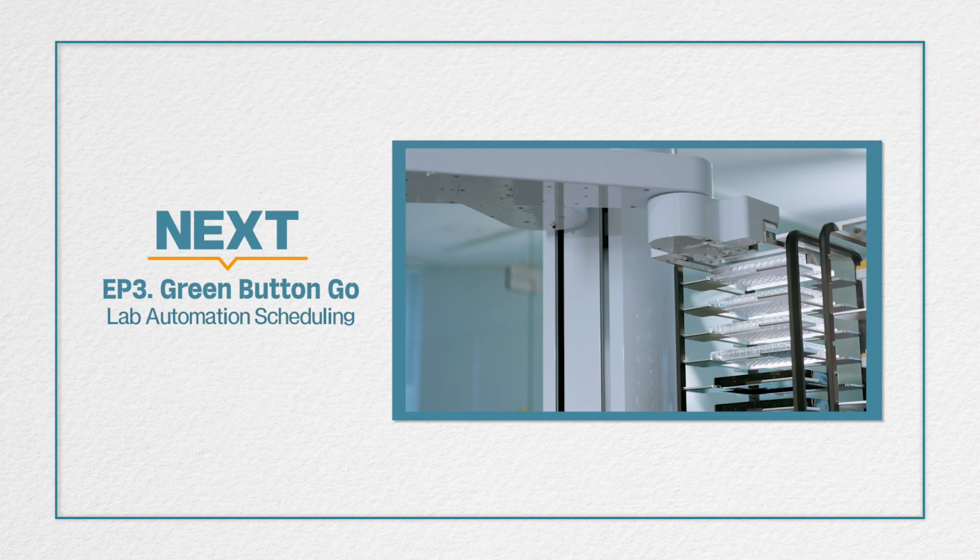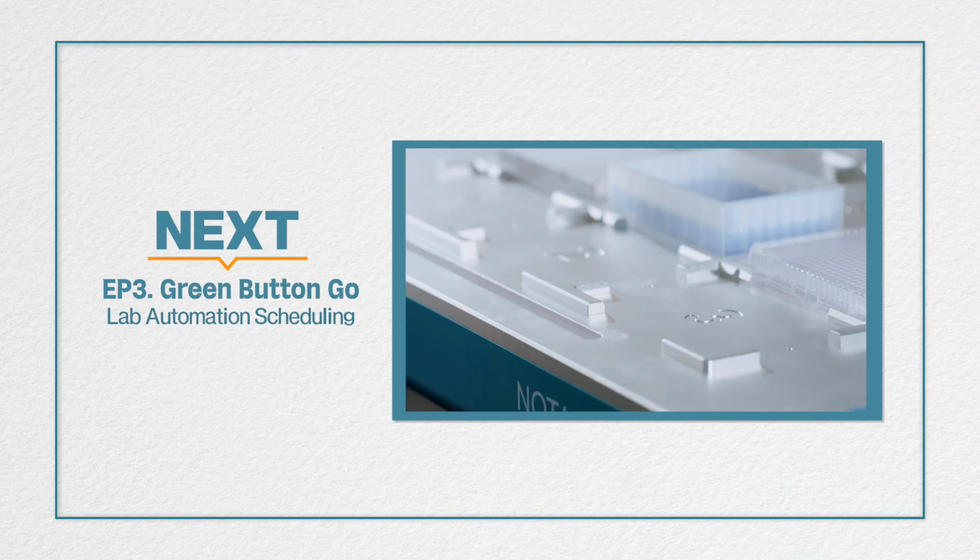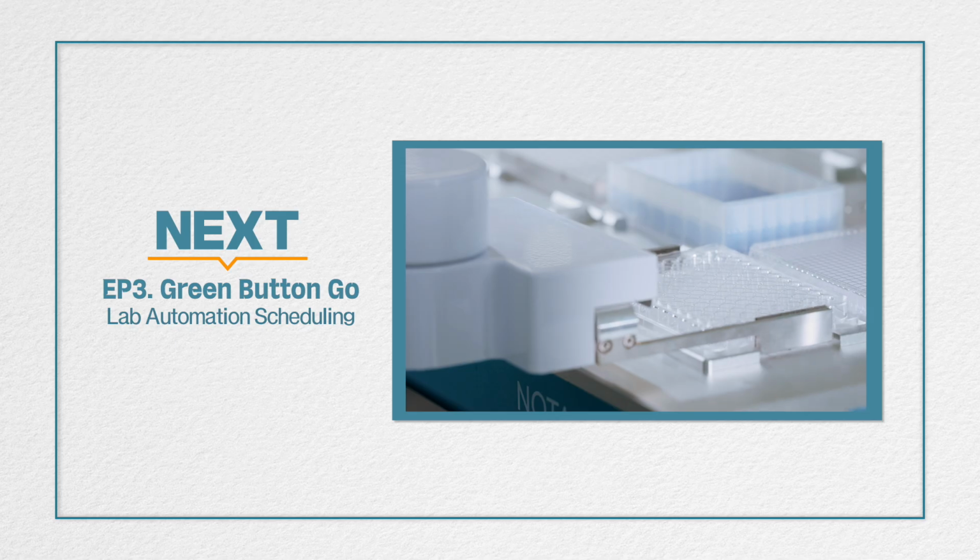The next episode introduces Green Button Go, our lab automation scheduling software.